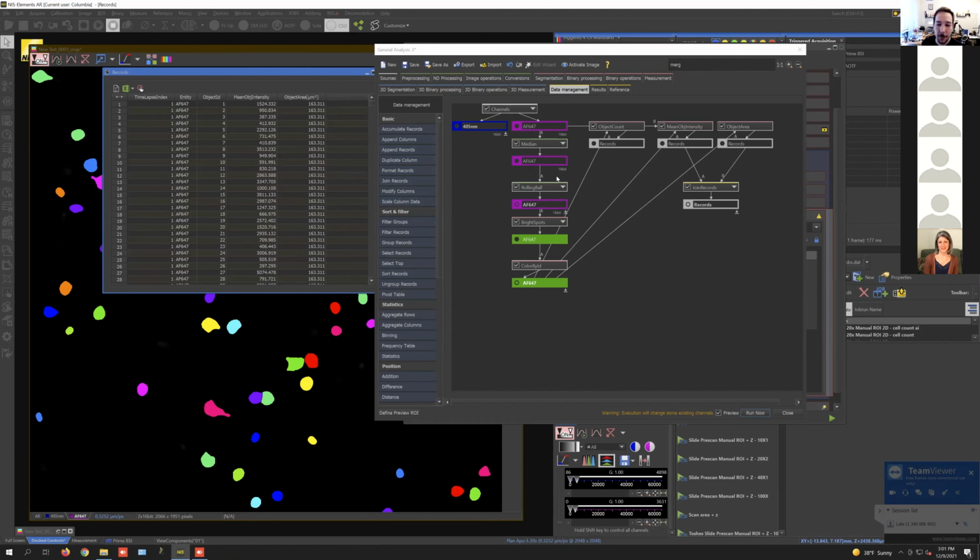The next step is actually way more complicated than it really needs to be. We want to actually get a CSV file from this, and if we try to run this on multiple images, you'll find an issue where it just tries to write the same file every time. And so what I've got is a pre-made job that does this for you. I'll actually take you through it so that you can see how it works.